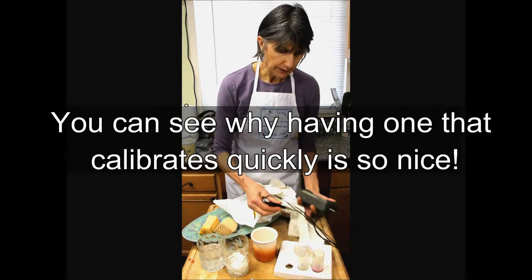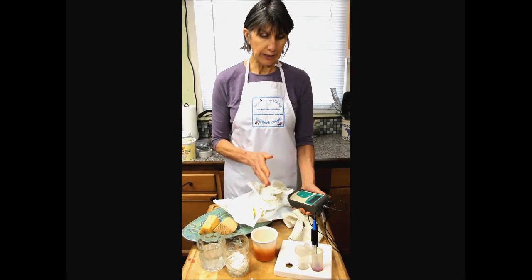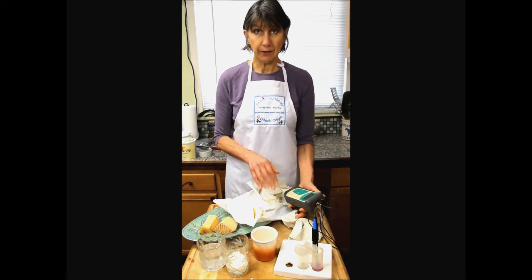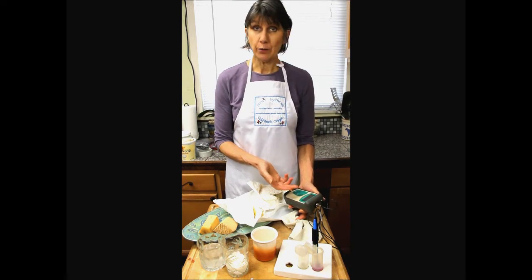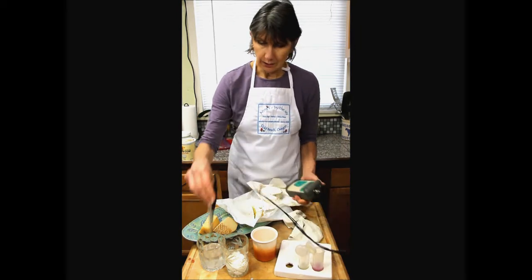Rinse, blot, and into the 4. And if it reads correctly at the 4, I won't calibrate it at that number. You need to calibrate it if it doesn't read correctly. Typically cheesemakers will give themselves a 0.03 variance. So if this reads 4.03, it's within comfort zone. And it's 4.01, so it's totally great.